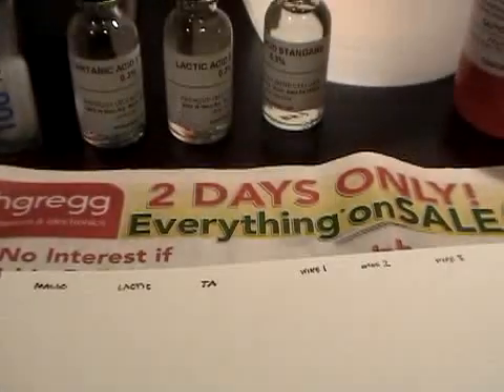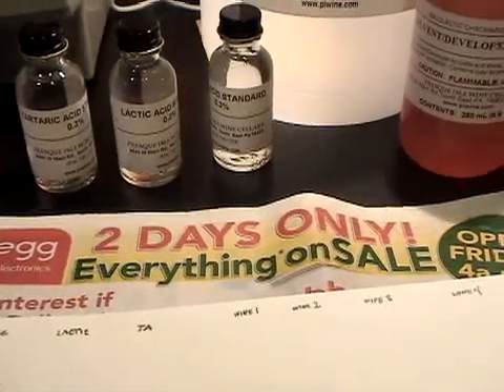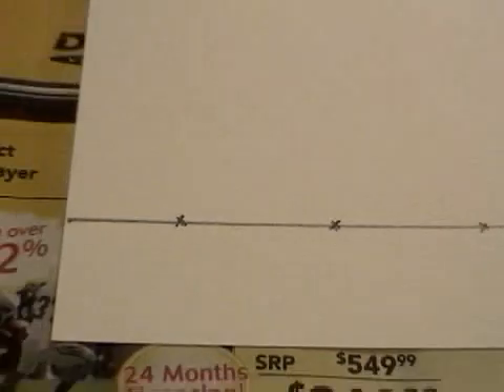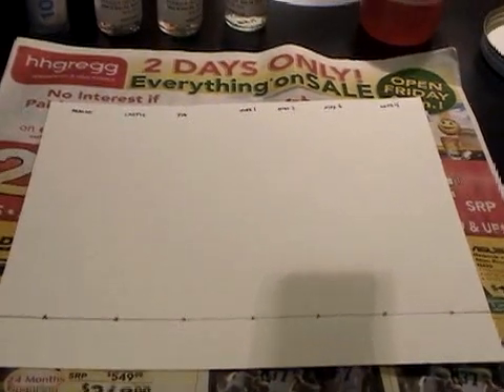I went ahead and took a piece of paper out and I drew a line with a pencil one inch from the bottom. And I put X's where I'm going to put each sample. The standards that come with this test are tartaric acid, lactic acid, and malic acid. Each of those standards are going to get a little dot on this paper. I marked it at the top, and down below I'm going to put the dots right on the X's. Then I have four vessels of wine that I'm going to sample, and I marked those at the top along with their accompanying X's at the bottom. So in all I'm going to have a sample going across including the three acid standards.